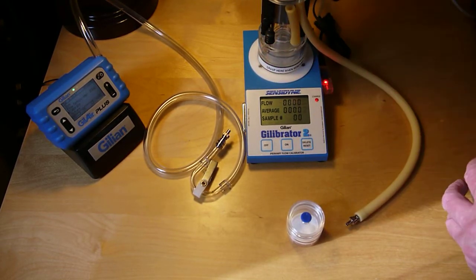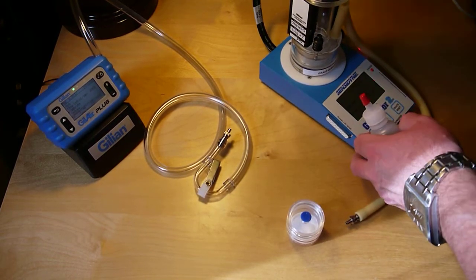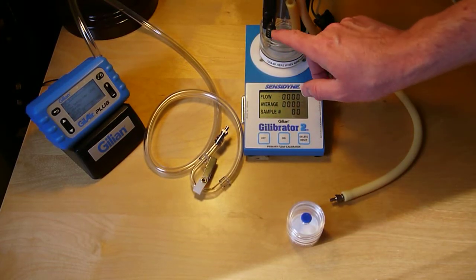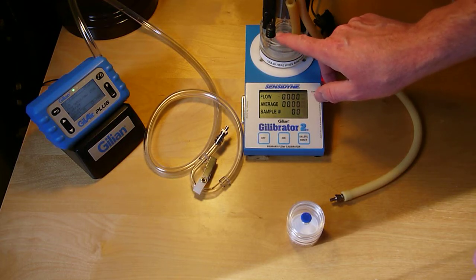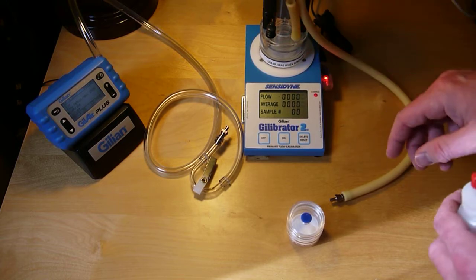I've got the flow cell in place with the ribbon cable connected to it. It's a good idea to run a bit to get the liquid up the tube, because it makes a measurement by measuring how fast the flow of that bubble is through that tube.